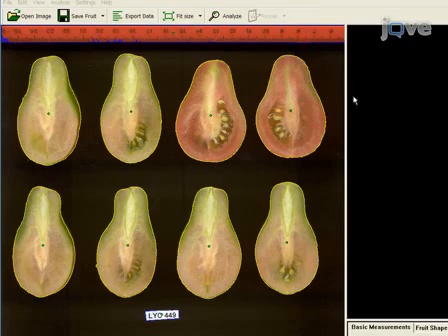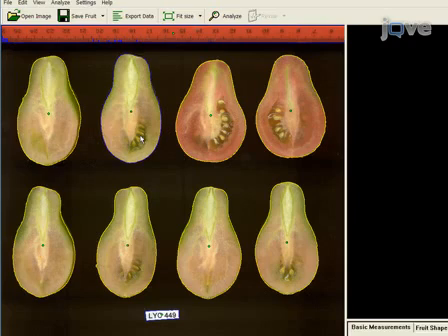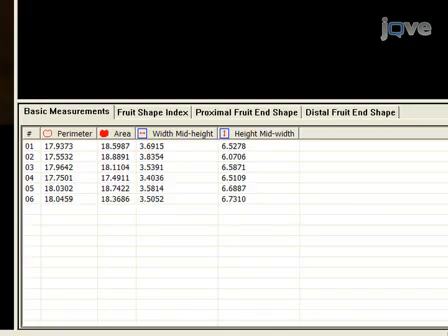The software automatically deselects very large or small objects, such as a ruler or label. The deselected objects are highlighted with a blue line. Use the ruler to make sure that the units and resolution were selected correctly by comparing with the height and width measurements. Additional fruits can be deselected by right-clicking on their image. Only items outlined in yellow are displayed in the data window and exported. Items outlined in blue are not included in the analyses.